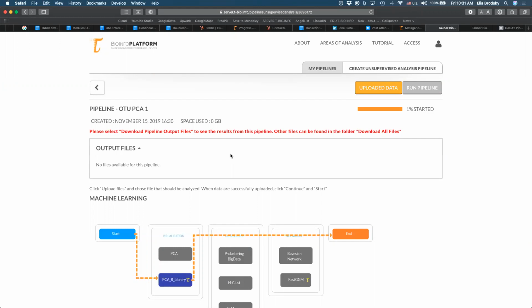It's a useful way to simplify the data, reducing the dimensionality or the complexity of data to just get a sense of what is in my data. Okay, so we're going to give it a couple of minutes to run. We'll see what the output is.